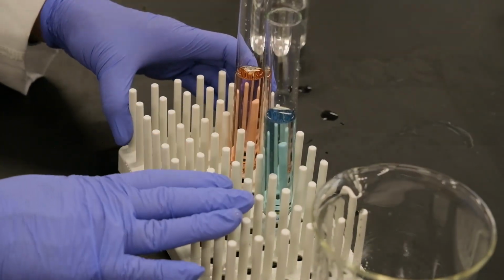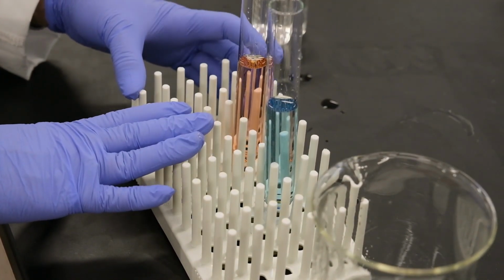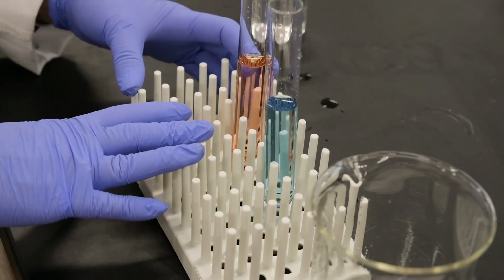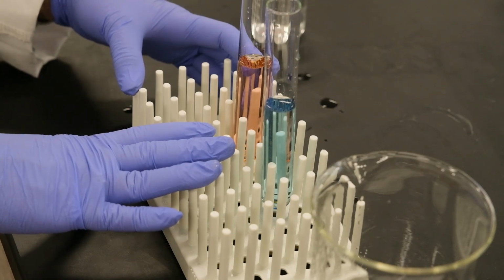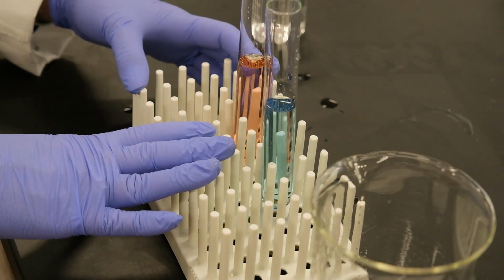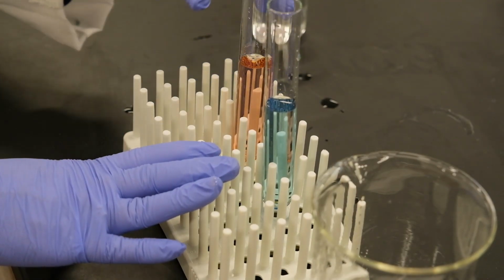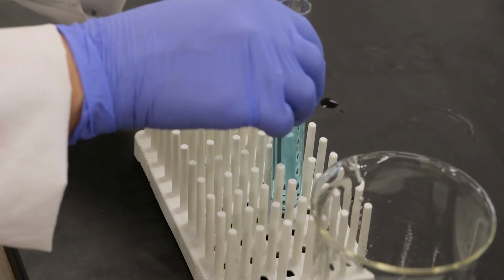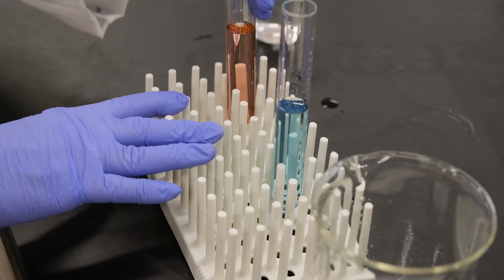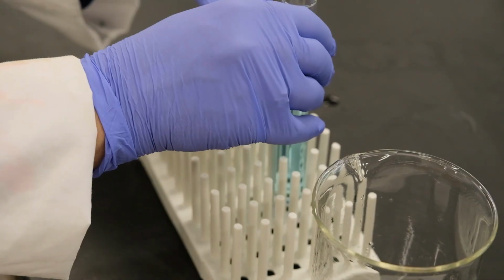We now use these two solutions to determine their concentration, and then we'll perform the calculation based on the calibration curve that we have. Actually, we are going to measure the absorbance, and using the calibration curve that we have built with the Allura red and the brilliant blue, the Allura red from experiment 13 and the brilliant blue from experiment 14, we're going to determine what is the concentration of the two dyes in the Kool-Aid.